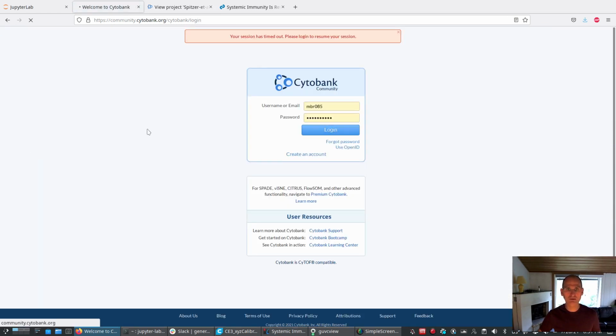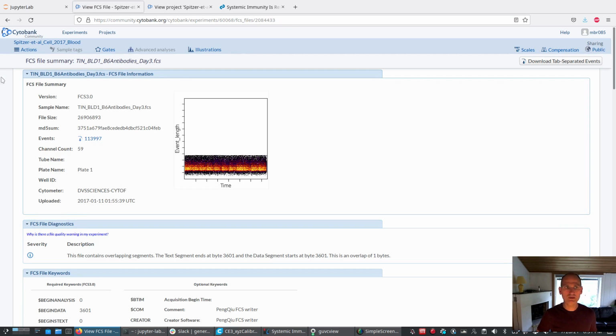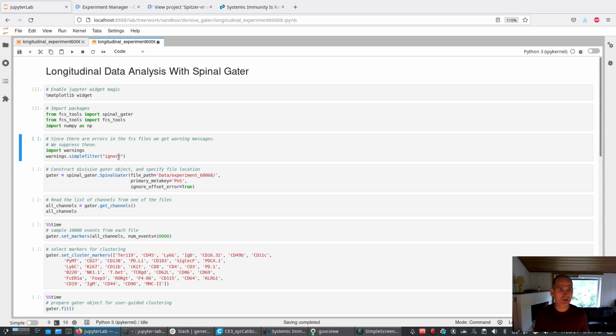Oh, it tells me that my session has expired. Please forgive me. What I want to know is that they say there are warnings, some problems with the files. So I'm suppressing warnings because there are errors in the FCS files.